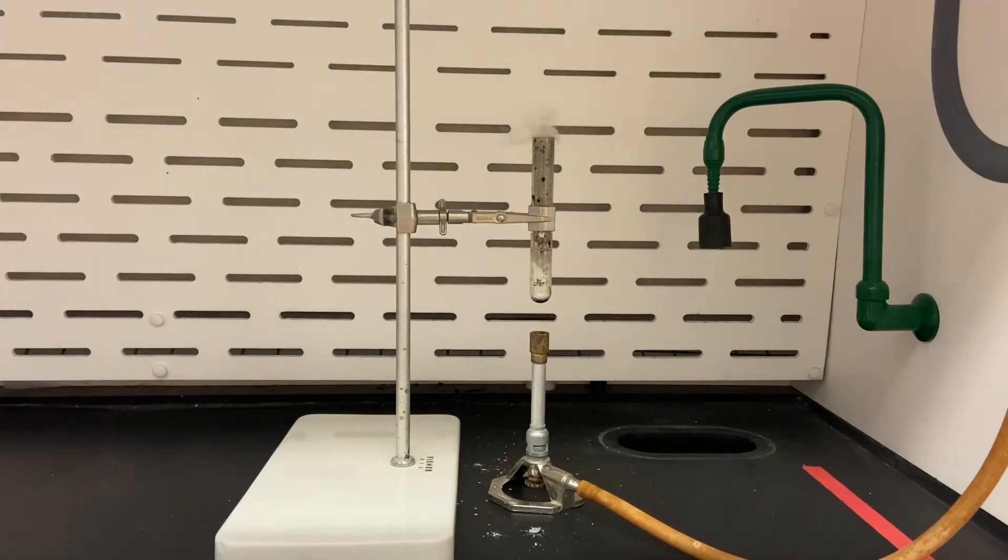Okay, so the reaction that you just observed was the oxidation of the sugar in the skittle. So once we allow that tube to cool what we're going to find is there's a big fat piece of carbon left in the tube after it reacted with potassium chlorate after it underwent its oxidation.